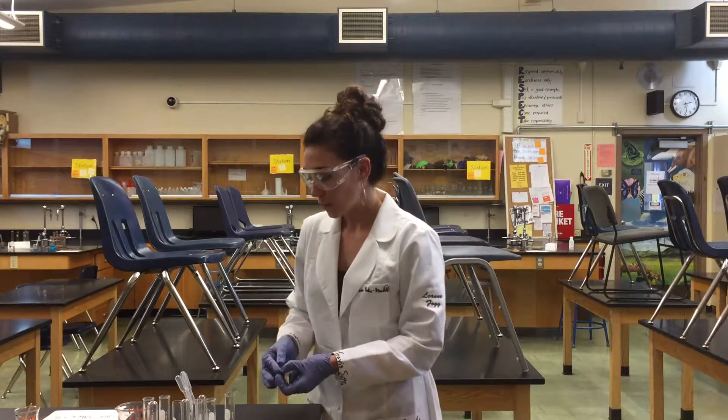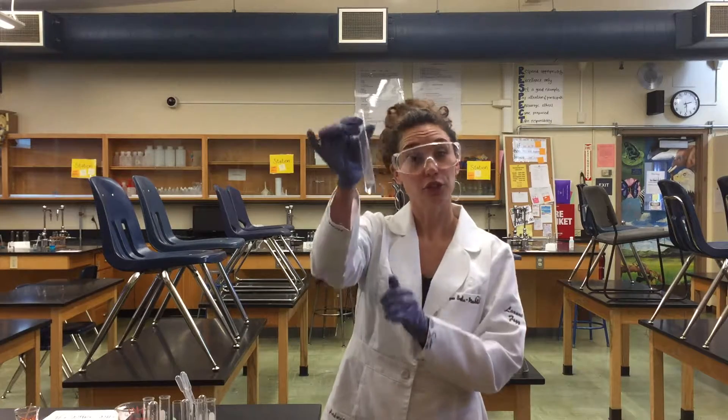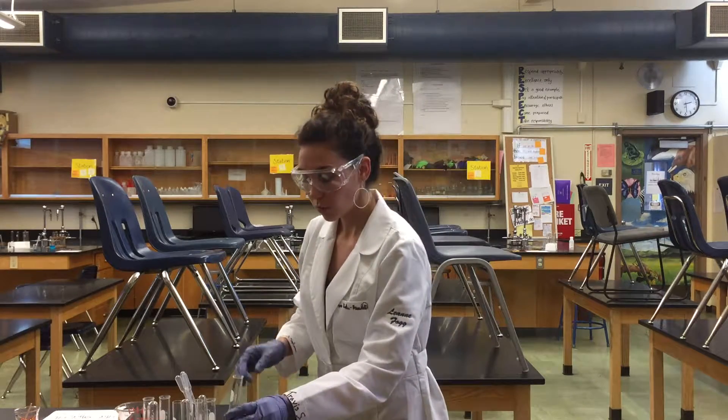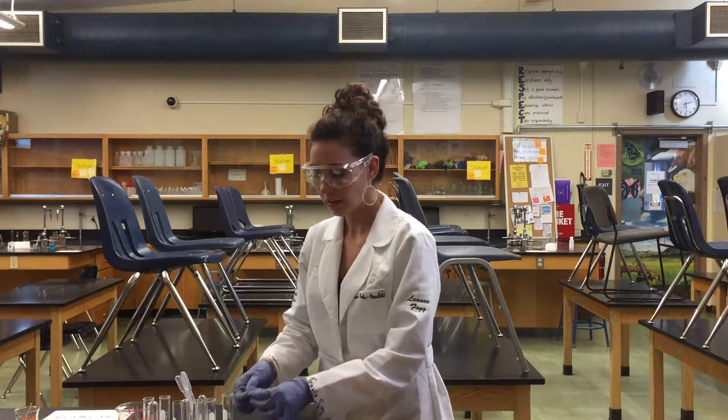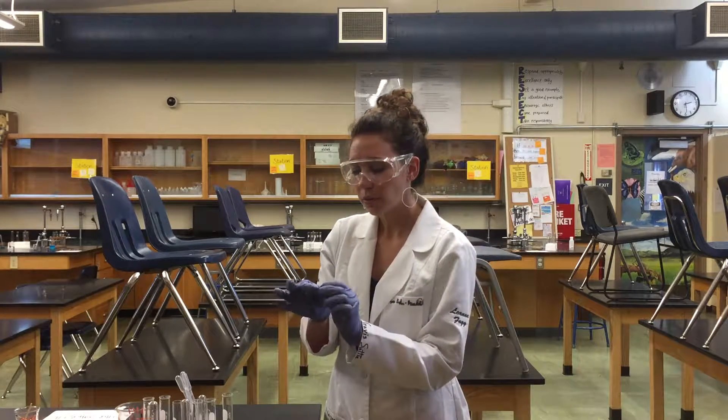At this station we are taking one molar hydrochloric acid and adding a little piece of magnesium ribbon, coiled up into a ball.